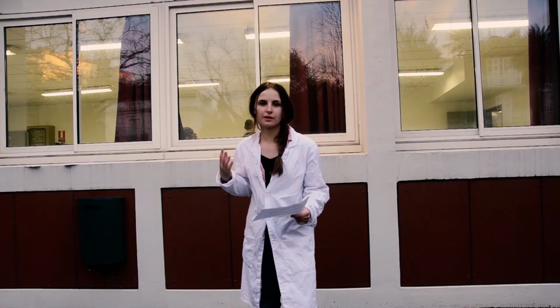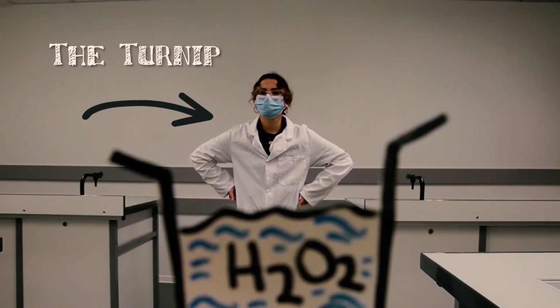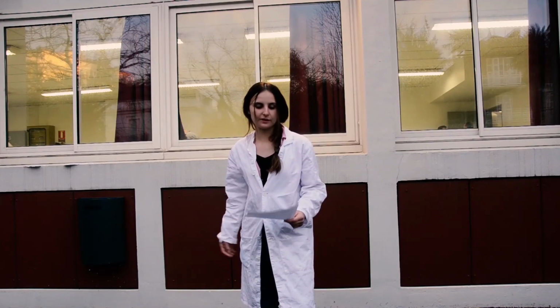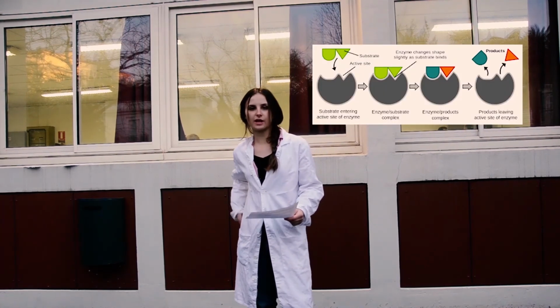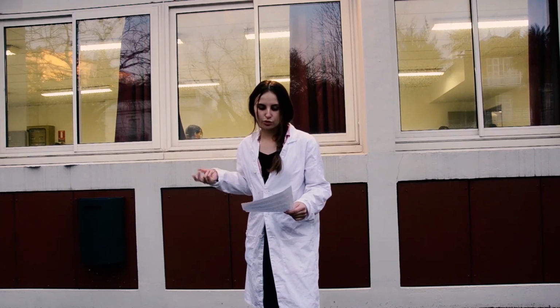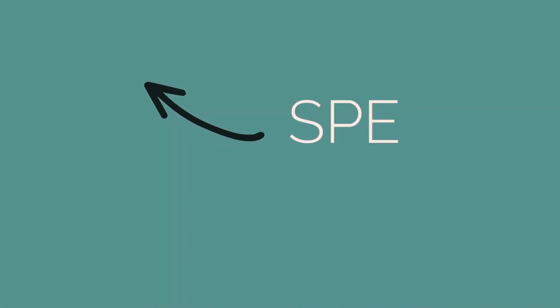Finally, we experimented with turnip, which is an enzymatic catalyst. So here we obtain a gas release, which proves there is a formation of O2. Indeed, each enzyme has an active site into which the molecule that reacts on the enzyme enters. Compared to the control tube, where nothing happens, we see that the three catalysts accelerate the reaction. They increase the speed of the reaction, or decrease its duration.